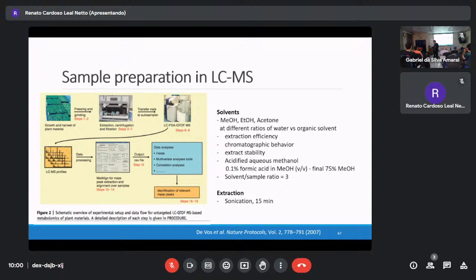If you have a saponin-rich sample, you cannot get a successful result or there is some problem with ionization, so you always lower the acid condition. 0.01% formic acid sometimes works very well with saponin-rich samples, but it's a very rare case.